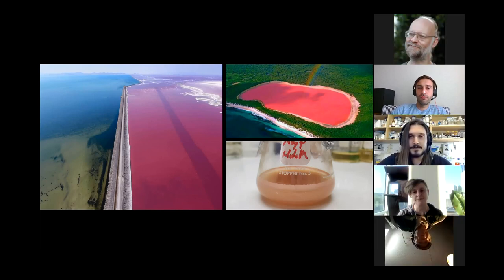So we decided to focus on Halobacterium NRC-1, which has been sequenced a while back. The beautiful part about this bacteria is that it lives in an extreme environment, but for it, our environment is also equally as extreme. So if you take Halobacteria and put it in water, it just explodes, releasing its proteins and its DNA. You can literally do a DNA prep with water, right? No miniprep, no fancy wash buffers. It's literally just spin it down, crack it with water, and you have beautiful high concentration DNA.